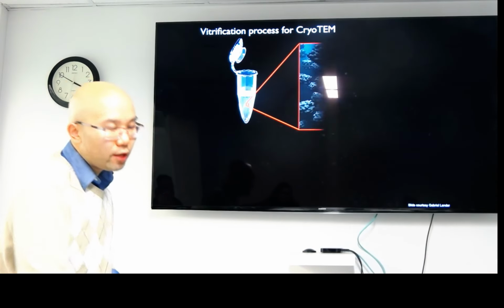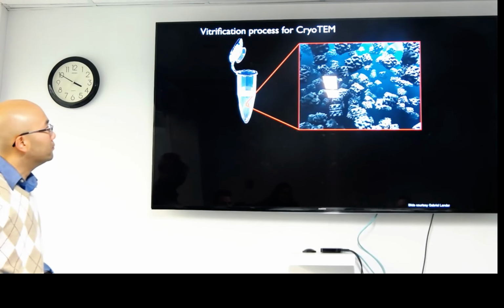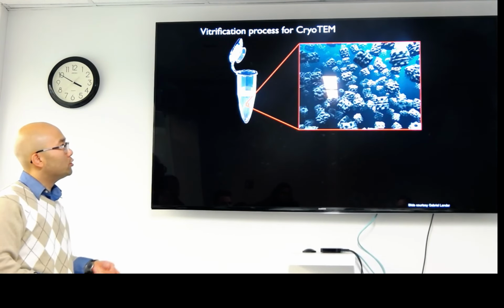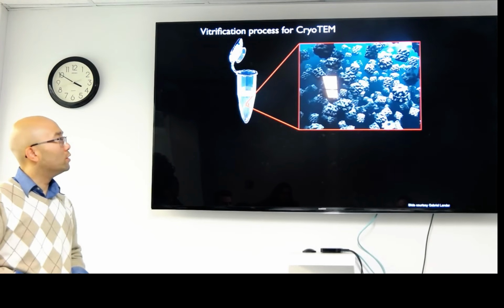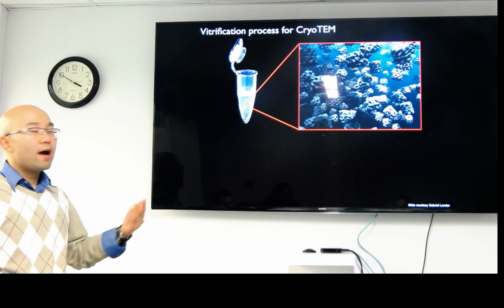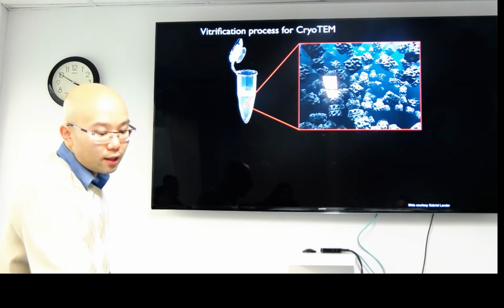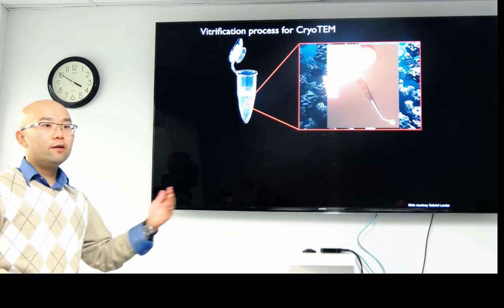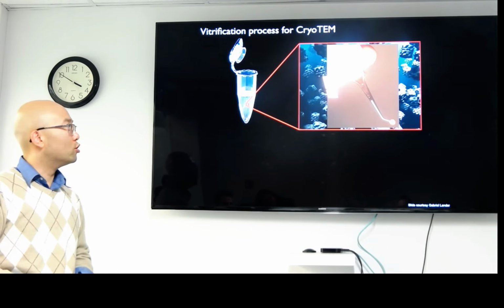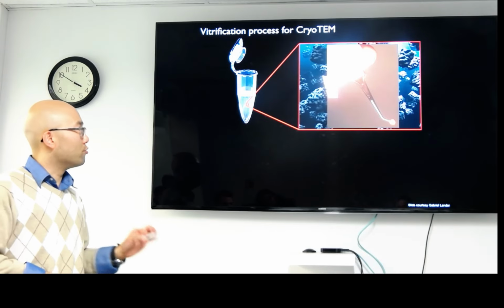So typically when people talk about Cryo-EM, they're really referring to single particle Cryo-EM. In this particular case, you would have purified proteins or protein complexes, or they could be macromolecular complexes, for example, ribosomes. They're floating in solution, and we put it onto, if you think of EM as an inverted microscope, our glass slide, it's really a 3 millimeter metal mesh grid.